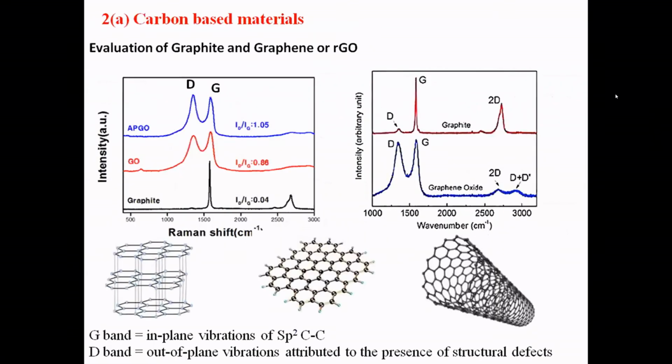Of course, Raman is highly popular and widely used for characterizing carbonaceous materials like graphite and graphene, GO, RGO, and their family of materials. Because of the layered structure, this is not easily possible with XRD or other techniques, but with Raman you will get it because it's a defective structure. Graphite has a bundle of graphene sheets, and you are literally taking a few layers out of it, so it comes with a lot of defects and structural disorders. That is all sensitive to the photonic scattering.